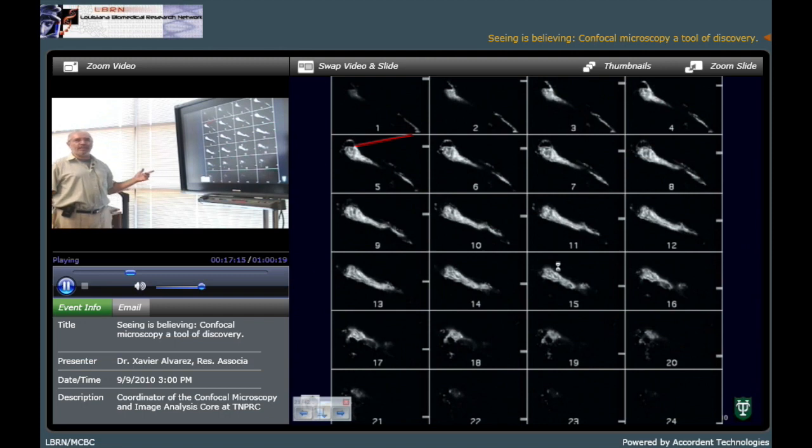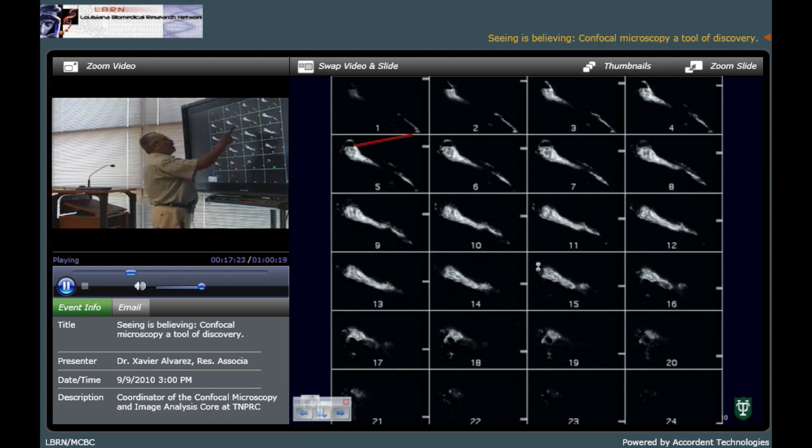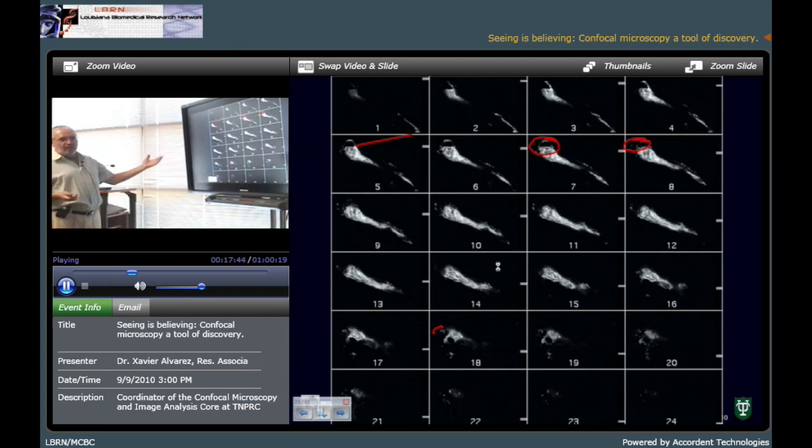This is a leukocyte that is moving, and I have another movie hopefully later on, but you could see these are the pods that a cell that is moving is making, pulling itself like this. Yes? But when had you seen this in the real thing happening? You see these pods. Then when we reconstruct all this gallery, the gallery is just a collection of pictures, we could see three-dimensionally how the cell is moving and how it is doing.